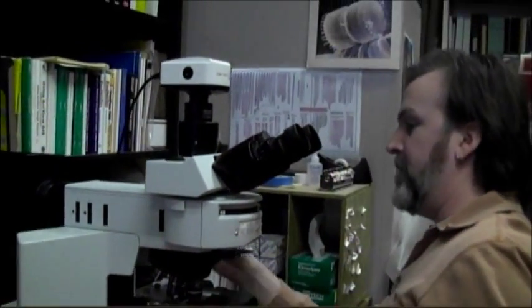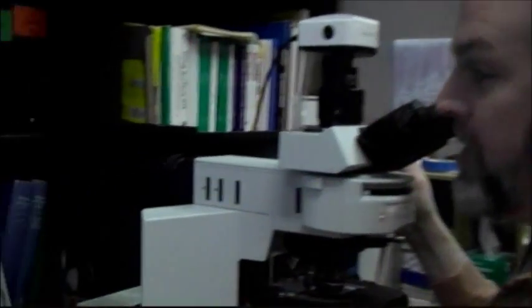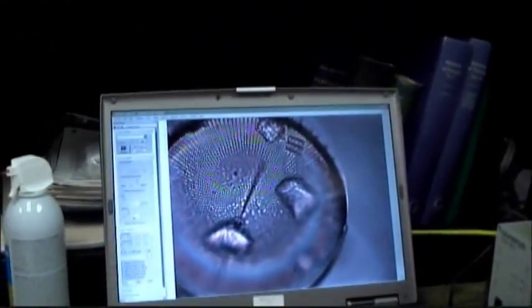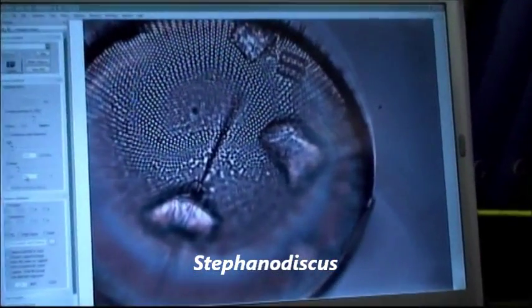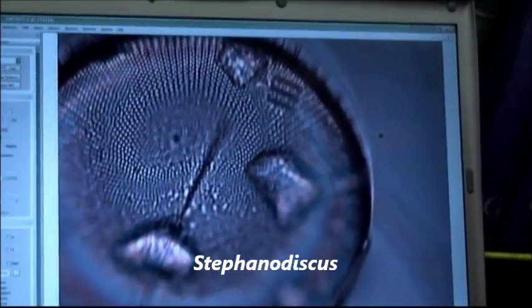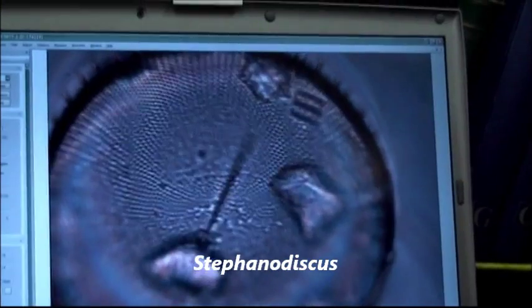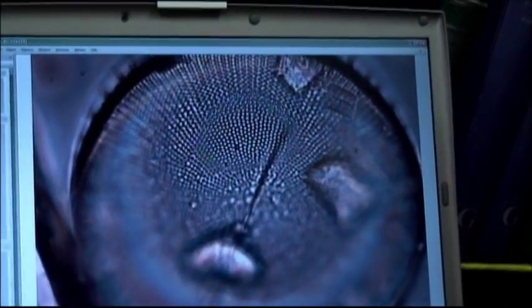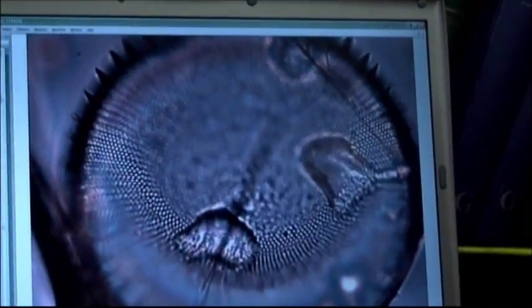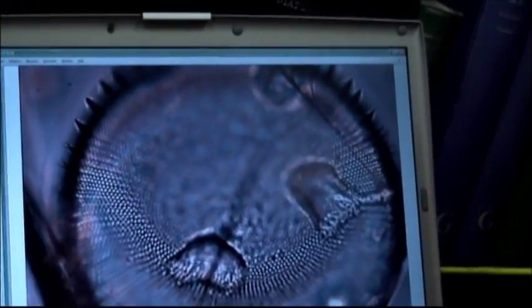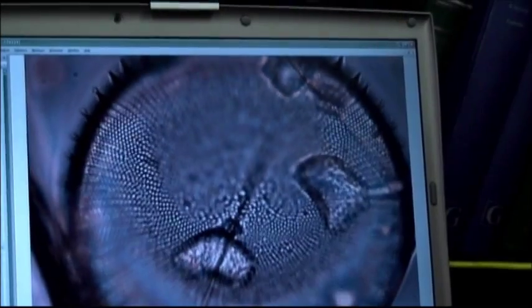So I am going to turn on the screen here so you can see it as well. So right away there's one huge diatom in our field of view. It's a centric diatom called Stephanodiscus, which represents high nutrient condition. And that's something because we study these so much, we look at some of these, we know immediately what it's telling us about environmental condition.